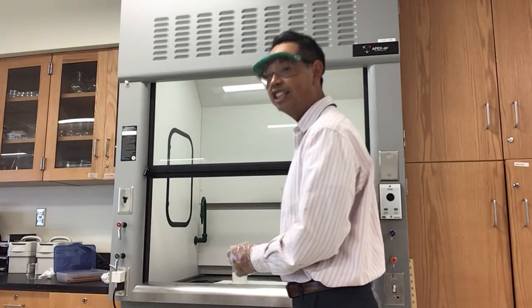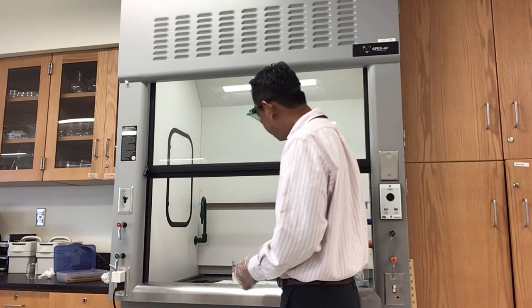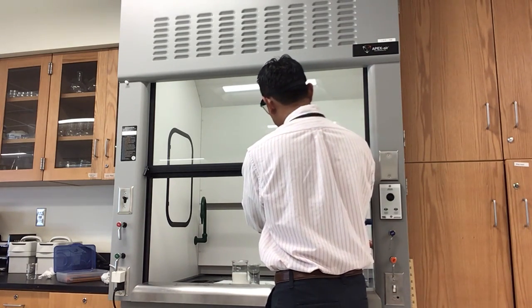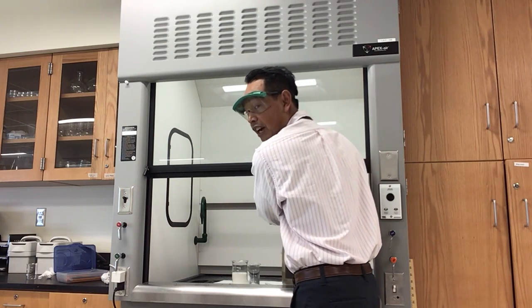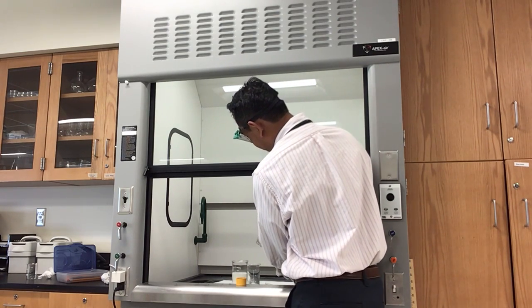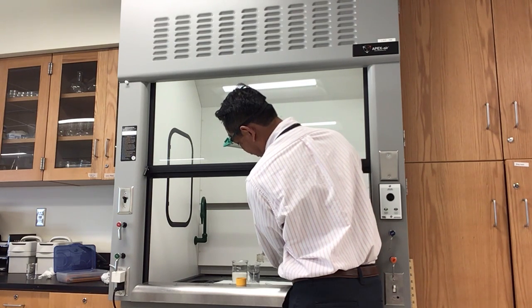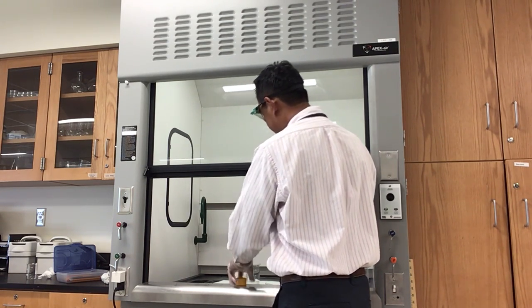And we're going to use 18 molar sulfuric acid. Very, very strong acid. Okay? I'm doing everything in the fume hood because even the odor, the vapor, it's all toxic. I put in about 50 mils or so of sulfuric acid. Right?